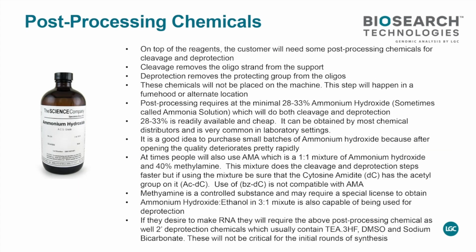As I say, for post-processing chemicals, there's a list of them and there are different mixtures. The most standard one is concentrated ammonium hydroxide, or ammonia solution. Smells delightful as well, so please use it in the fume hood, not on a bench. You want to have it fresh, because if it's been sitting, people sometimes get a 4-liter bottle to do 200 microliter reactions over 5 years.